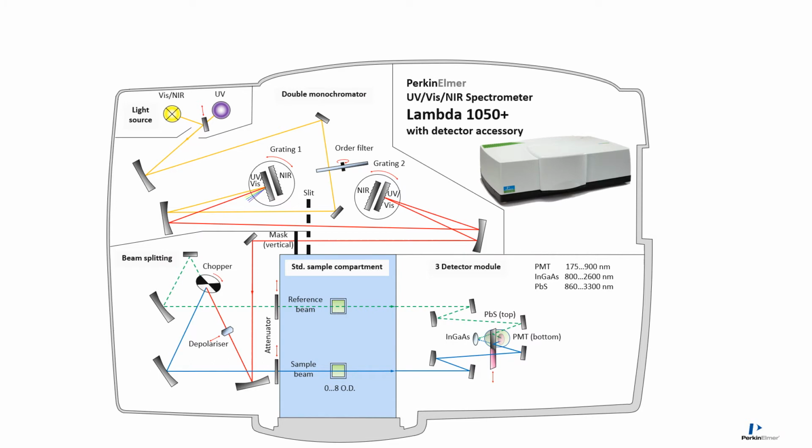Let's go back to what we refer to as the standard detector configuration from before, but now instead switch our attention to the sample compartment. This is the area to the left of the detector compartment. In many cases, samples and appropriate high-performance accessories can also be installed here to facilitate very accurate measurements. Indeed, in earlier times, when the detector compartment was considered to be passive in its ability to facilitate challenging measurements, all of the difficult measurements were performed here instead. That option still remains to this day, so it should also be considered when performing challenging measurements.